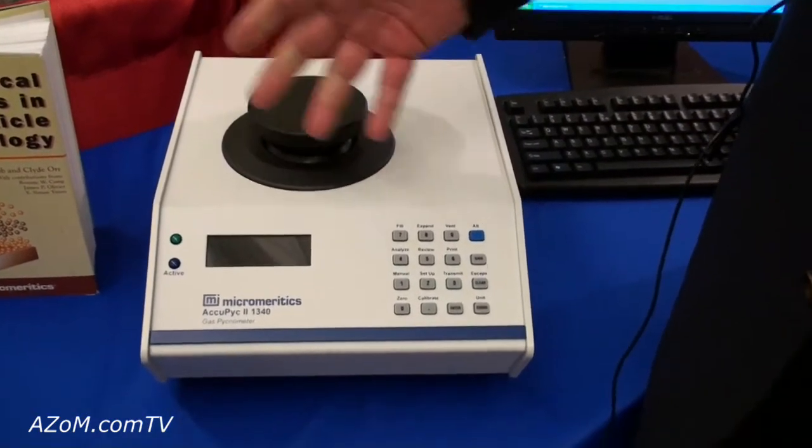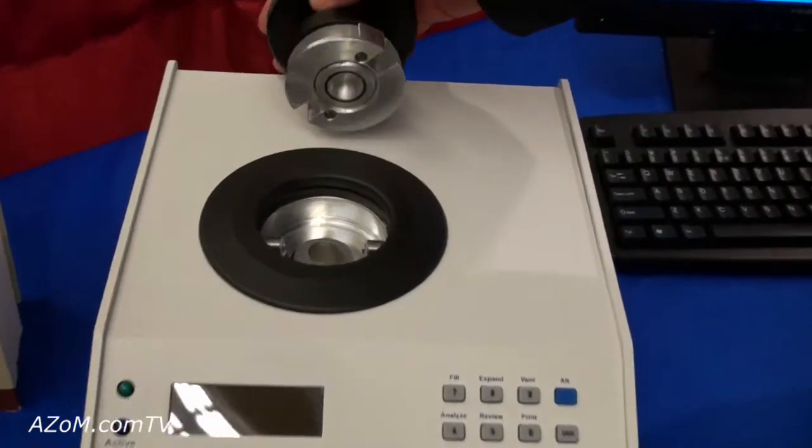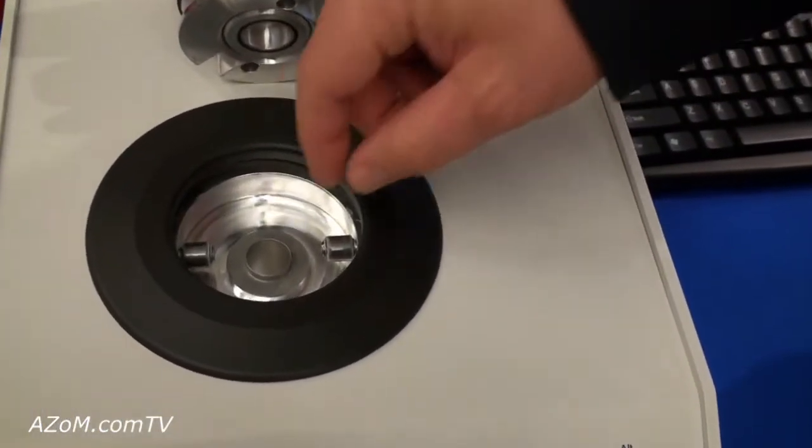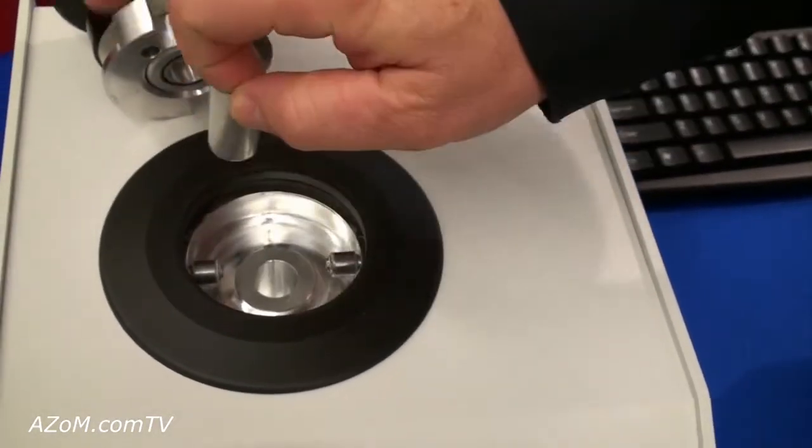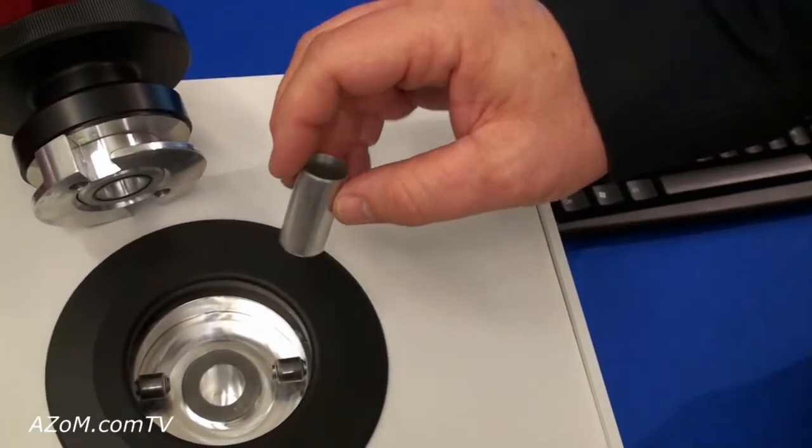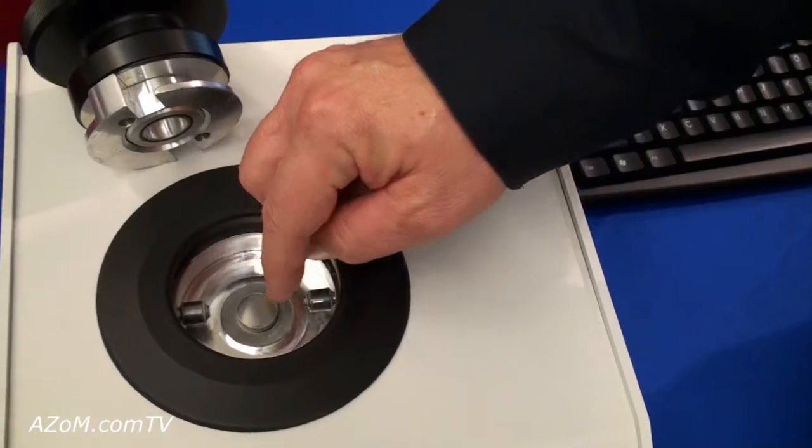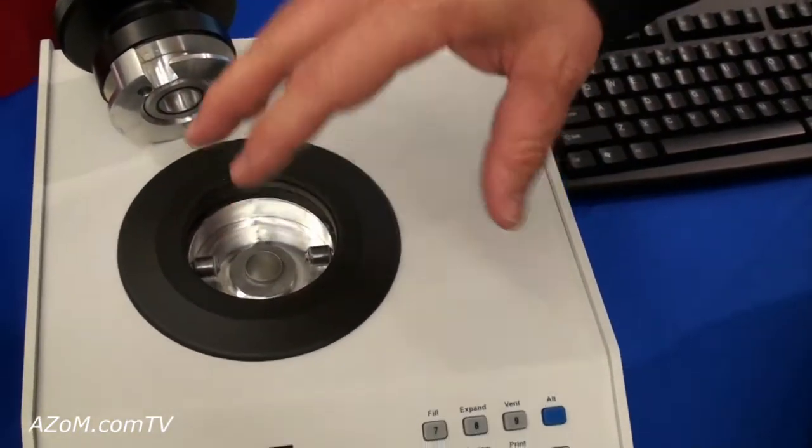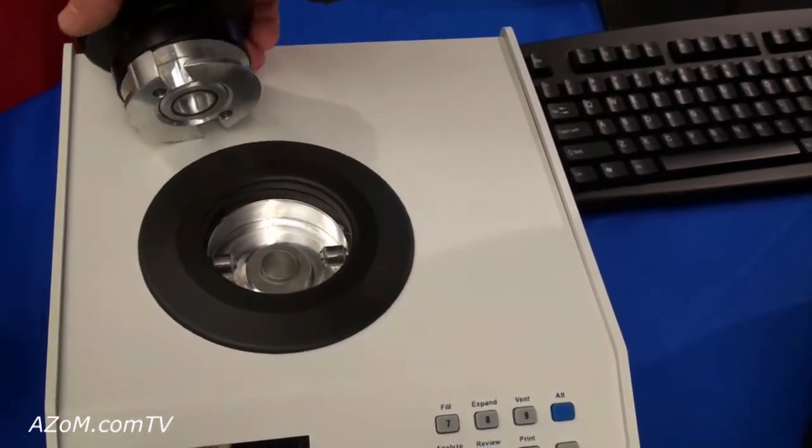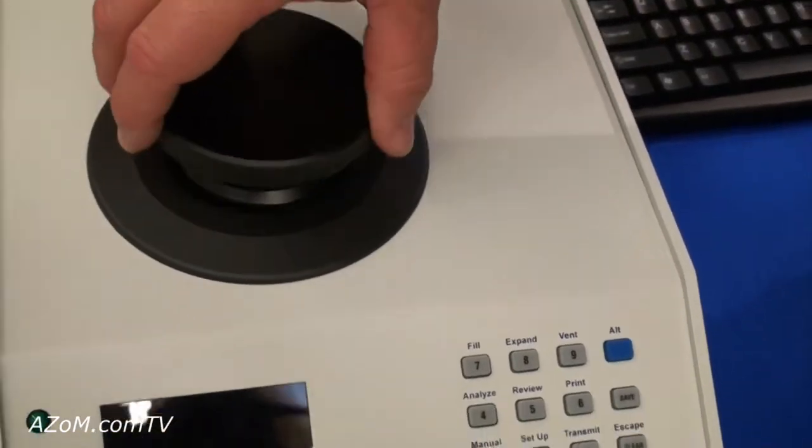The AcuPic has two chambers inside the system, one where a sample is placed. This is an example of our 10cc sample cup. We also have a 1cc sample chamber and a 100cc sample chamber into which the sample can be placed. In fact, we have custom designed these for a number of needs that people express in sizes that fit the particular sample sizes that they require.